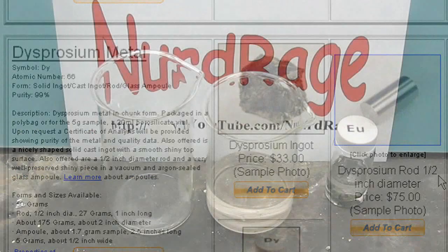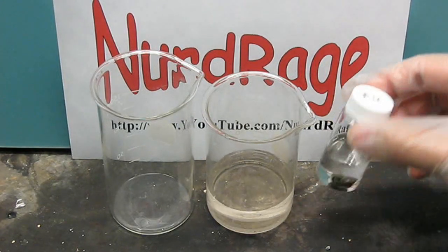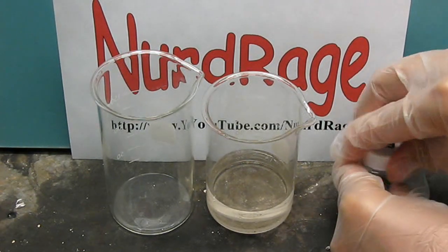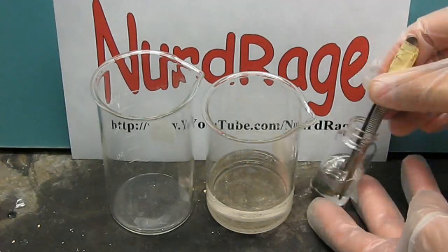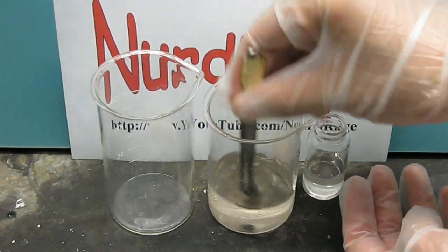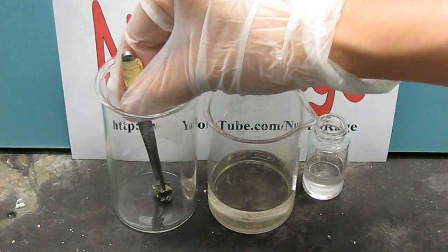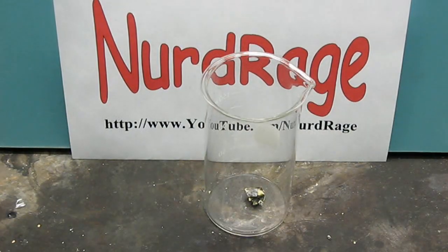Let's first start with europium nitrate. Here we have a 2.5 gram sample of pure europium metal. Europium metal is highly reactive even toward air, so when you buy it the europium will come stored in mineral oil. Carefully take it out with tweezers and wash it thoroughly in some toluene to get rid of the mineral oil. Hold it in the air for a few minutes to dry it out, then place it in a beaker. As you can see, it's already starting to react with the air to produce a yellowish white oxide layer.